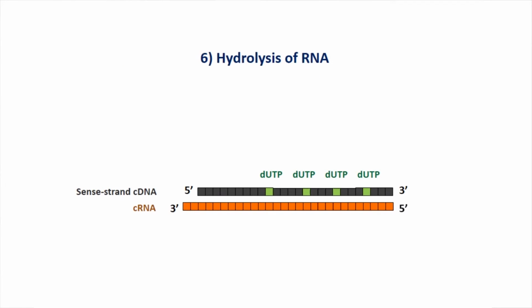In this step, RNase H hydrolyzes the cRNA template, leaving single-stranded cDNA.